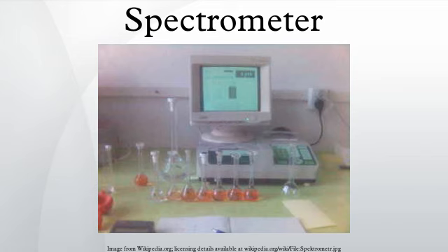The plant pigment phytochrome was discovered using a spectrograph. It used living plants as the detector. More recent spectrographs use electronic detectors, such as CCDs, which can be used for both visible and UV light. The exact choice of detector depends on the wavelengths of light to be recorded. A spectrograph is sometimes called polychromator, as an analogy to monochromator.